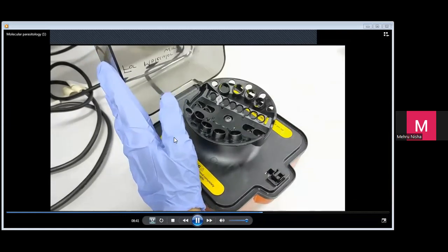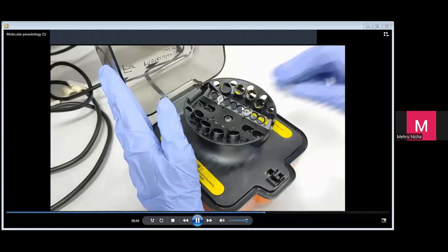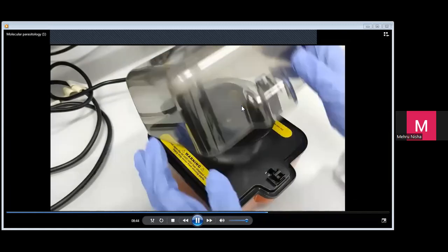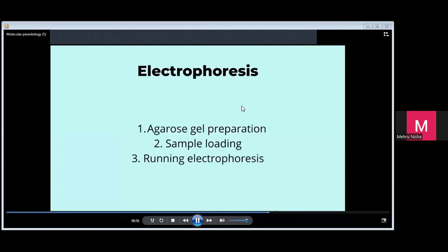Selepas itu kita, let's say now PCR dah habis. Sampel-sampel itu perlu di spin. You have to spin it to pull it down, untuk tarikkan semua fluid di bawah. Okay, sekarang PCR dah habis. DNA dah buat, PCR dah buat. Sekarang kita kena run gel. We want to run the gel and see PCR kita ni sukses atau tak sukses. Kalau sukses, you akan dapat band yang amplicon tu di agarose gel.